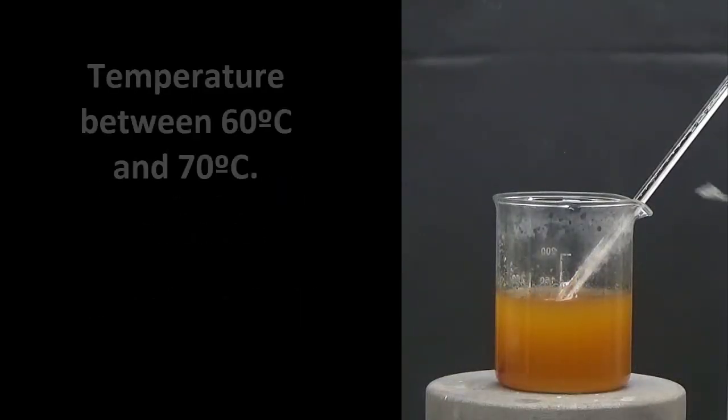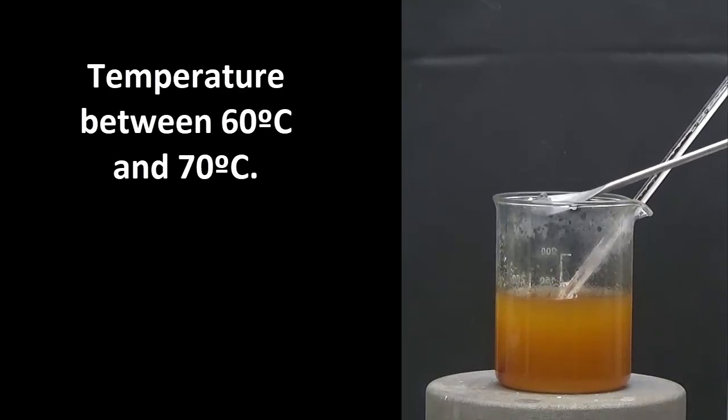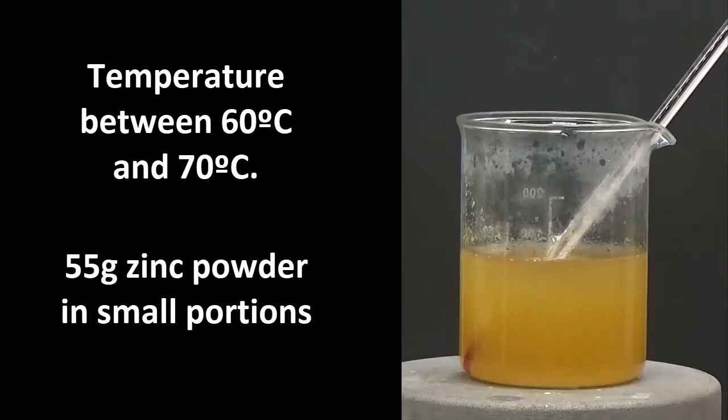With temperature at 60 degrees, 55 grams of zinc is added in small portions, making sure the temperature doesn't exceed 70 degrees. With too much zinc added, the reaction becomes violent and the temperature increases excessively.